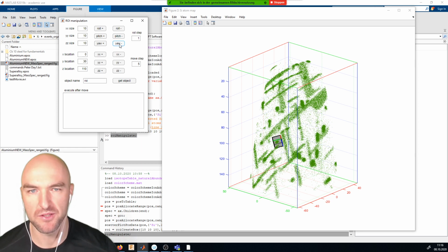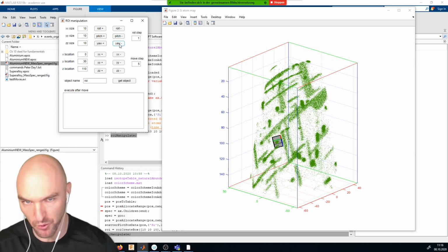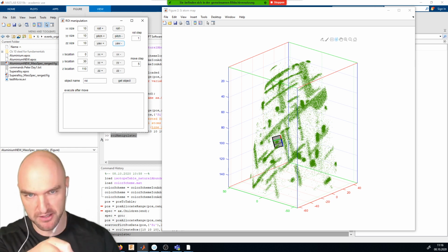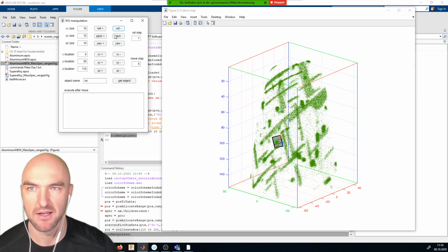And it will always rotate about my view axis. Okay, so if I change my view axis, it will rotate about the view axis. That's why I just started viewing the whole thing head on. Stretch it up and maybe roll it a bit more.